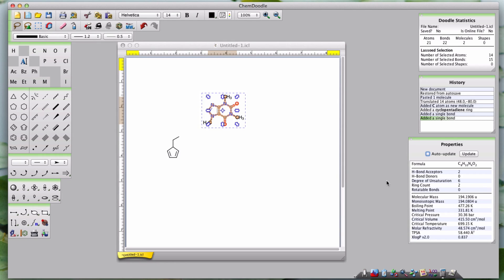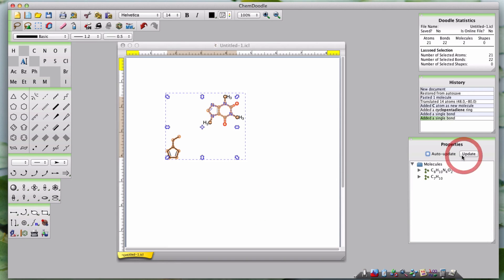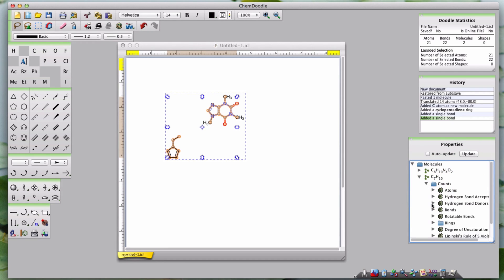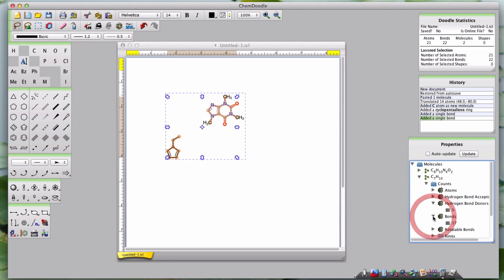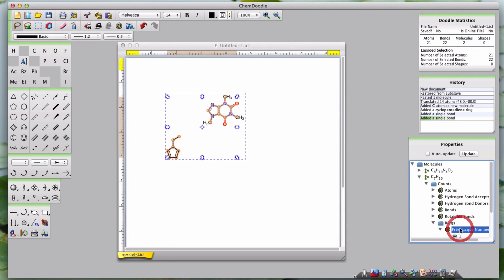When you are working on groups of molecules, you can select your chosen molecule and continue going down the tree by either clicking the arrow beside each descriptor title or by double-clicking the title itself.